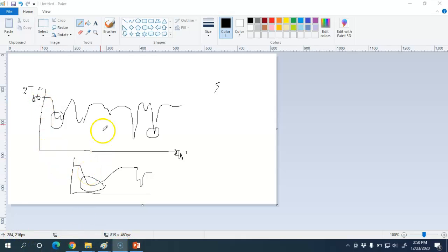For the conclusion, we can observe from this functional group or the graph I drew that the shape of the signal can be broad or sharp. For a broad shape, examples of functional groups are OH, hydroxyl, or amine group, NH, because of hydrogen bonding formed between molecules.